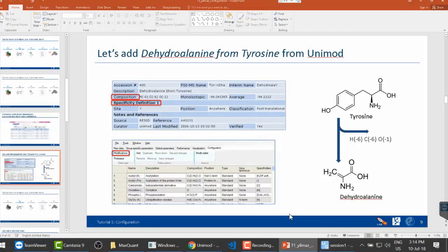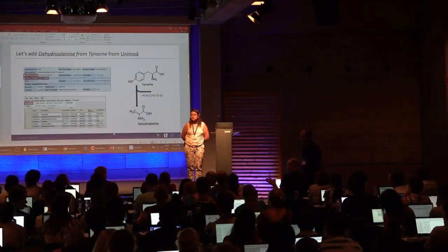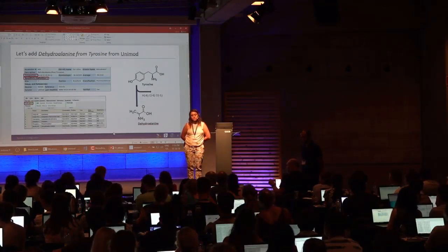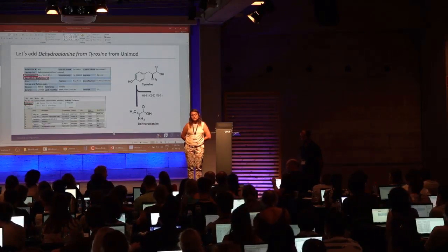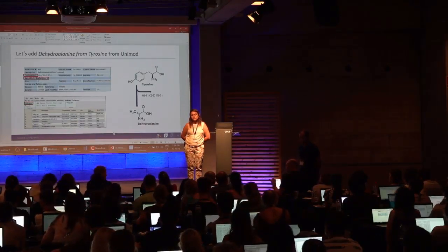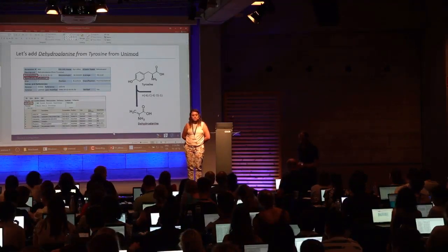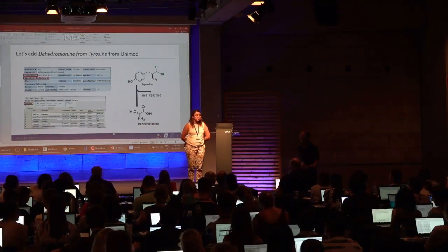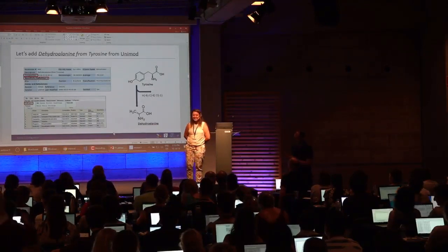Maybe I can just reply to that. So it's not necessarily the operating system that is in German, but you have something like regional settings, right? And this is in German, even if it's an English Windows. So if you see German words in the MaxQuant GUI, it has to be the case that your regional settings are German for whatever reason. If you want to see English there, then it has to be English. Or you could also see Spanish, right? Yes. And Turkish too, yes.